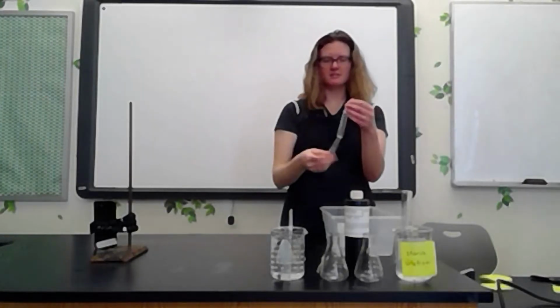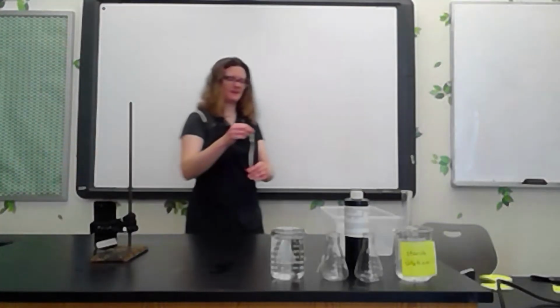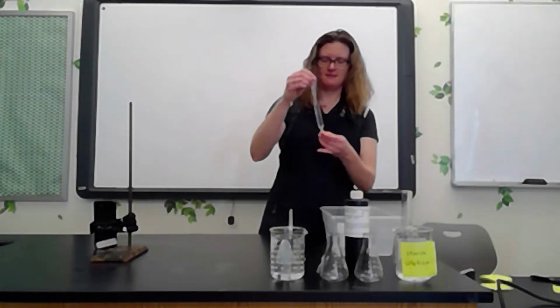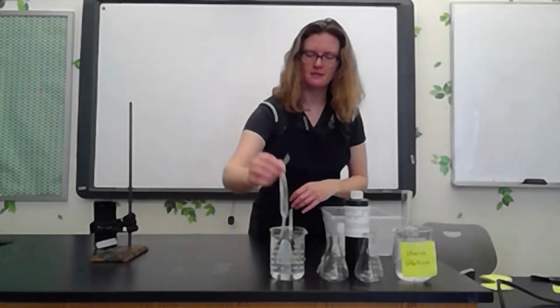I'm not going to rinse it off just in case any starch got on the outside during that process. All right, and then I am going to put my cell model, just make sure my knots are nice and tight. All right, I'm going to put my cell model here in this watery environment.